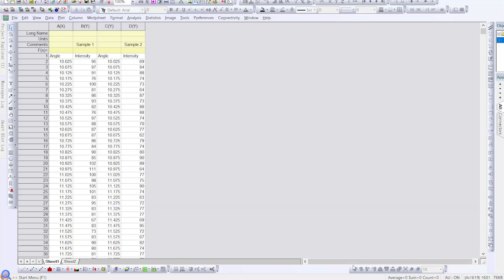Hello everyone, today I'm going to talk about how we can plot XRD data in Origin. I'm going to cover two easy ways and tell you each and everything from scratch, whether you are a beginner or new to Origin or want to plot your XRD data for the very first time. Here in Origin you can see I have data for two samples.